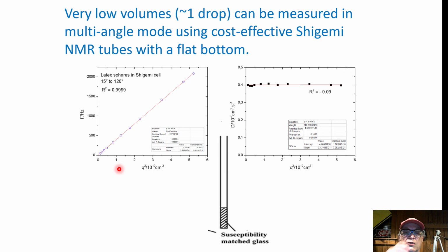Okay, DLS can measure very small volumes. With the help of some people at UT Southwestern Medical Center, we once did an experiment. These guys were looking at these coacervate phases. There's a lot of interest in coacervate phases now for trying to understand how various things happen in nature, how various diseases happen. They're like phases, only they're not really phases. They're very small, sort of nebulously defined things. Bretman Group is looking at them here. Many people are looking at them elsewhere.